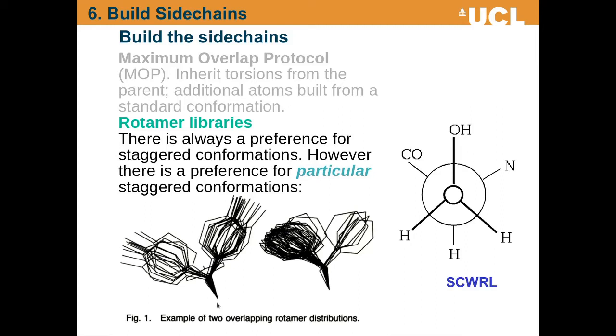And what you can see from that is that we have one quite tight cluster here, one slightly looser cluster here, and then one example in that third conformation here. So these are reflective of the three staggered positions, and you can see that there's a preference for this one, closely followed by this one, and then this one with hardly any.